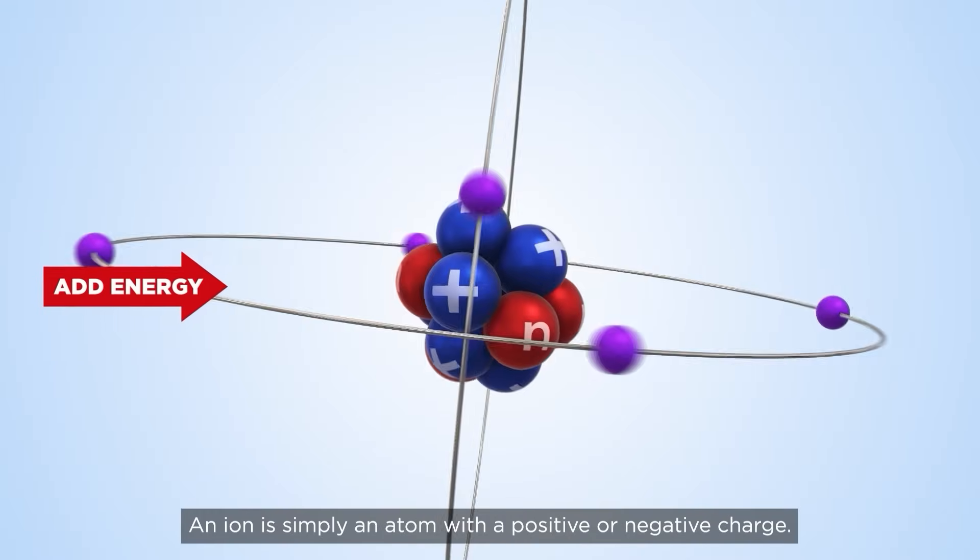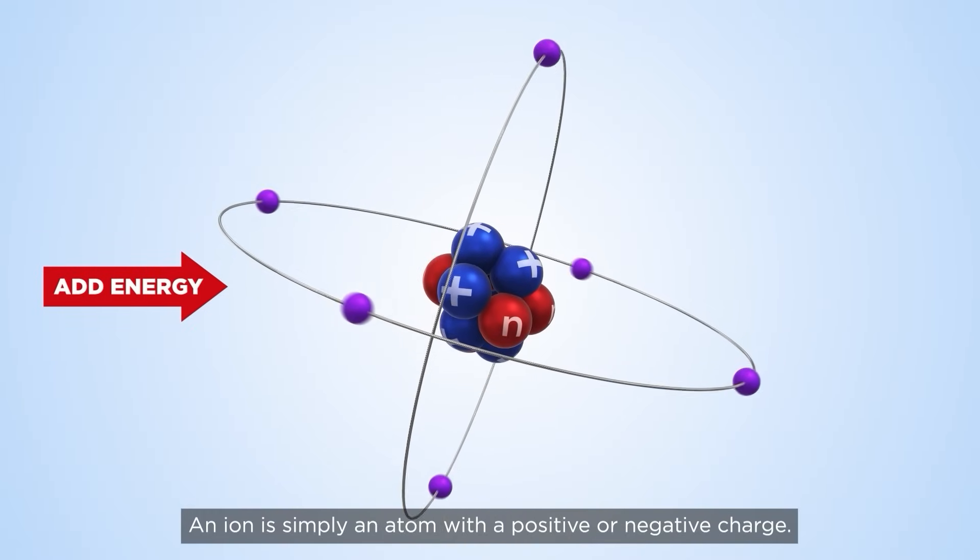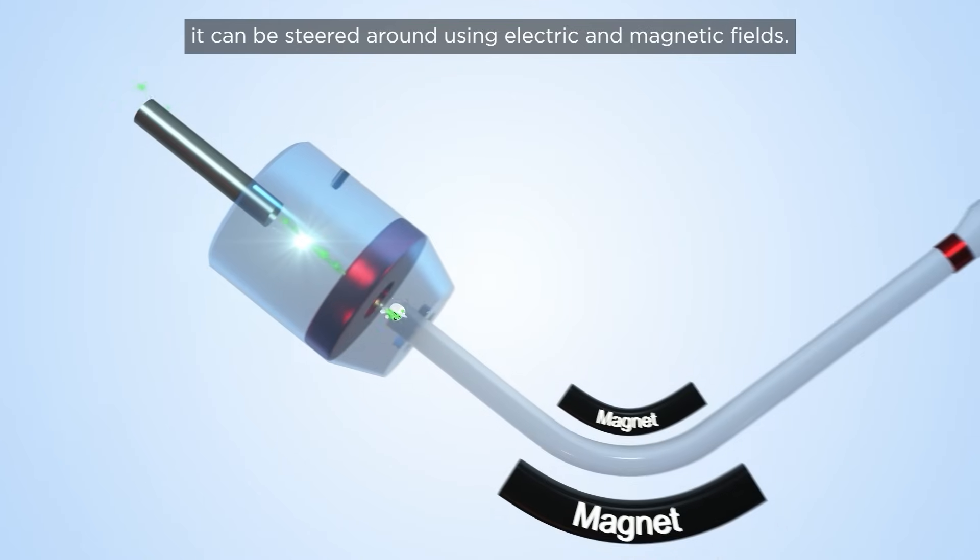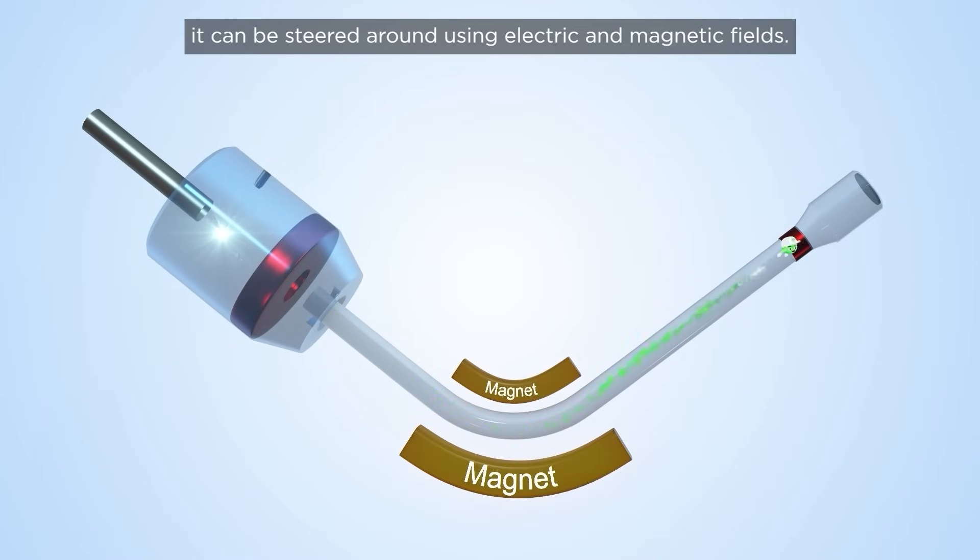An ion is simply an atom with a positive or negative charge. Once an atom has a charge, it can be steered around using electric and magnetic fields.